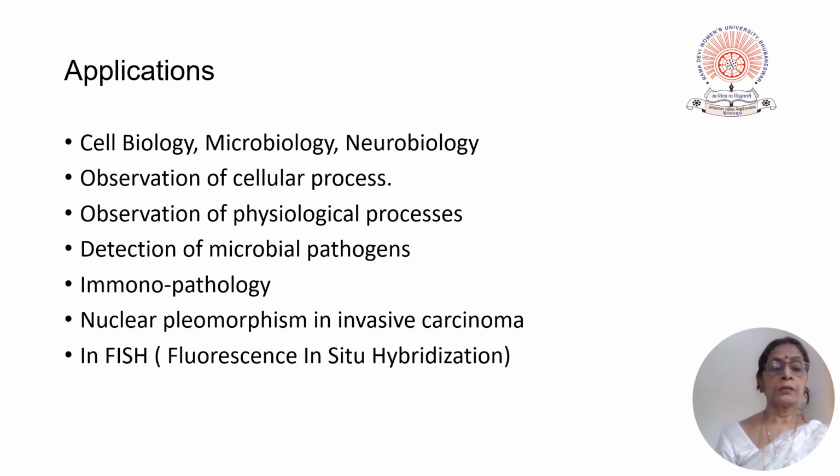It is used in cell biology, microbiology, neurobiology to observe the cellular processes, physiological processes, detection of microbial pathogen in patient samples in the field of immunopathology, and the study of nuclear pleomorphism in some forms of cancers in fluorescence in situ hybridization technique too.